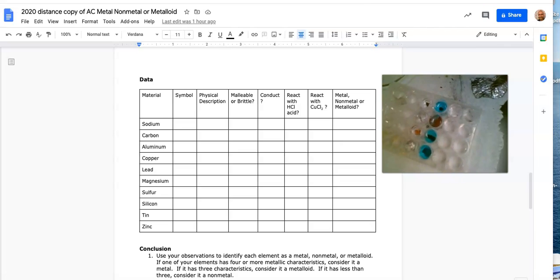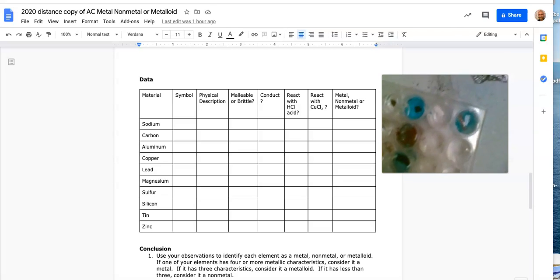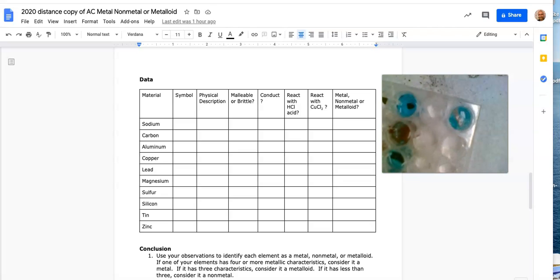With the acid, I am getting some bubbling and fizzing. That would be the hydrogen gas bubbles. And let me get a squirt of copper chloride to put in here with the magnesium. Hey, that one's also bubbling around. So I'm getting a reaction in both. In the copper chloride, it's also turning that coppery color just like the aluminum did, because the copper in the solution is swapping places with the magnesium.